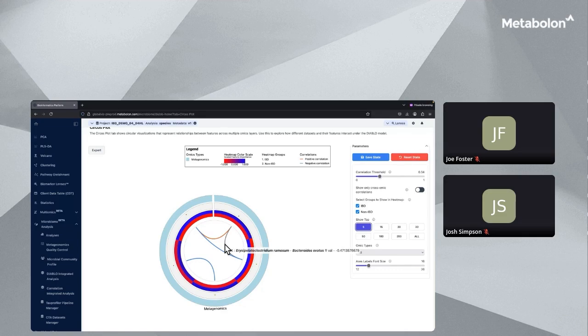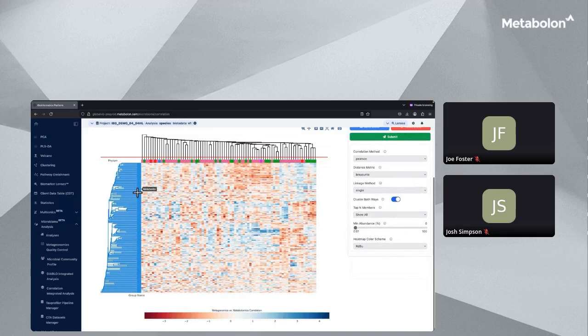Our final set of integrative analysis screens are comprised of correlation integrative analyses. These explore the strengths of correlations, either Spearman or Pearson, between all individual pairings of microbial taxa and metabolite abundances across the cohort. The correlation values quantify how strongly each metabolite varies as a function of each microbial taxa abundance across the dataset. These analyses help uncover microbe-metabolite relationships that are consistent across the full cohort, suggesting persistent biological mechanisms and offering support for key associations observed in metagenomics or metabolomics alone.